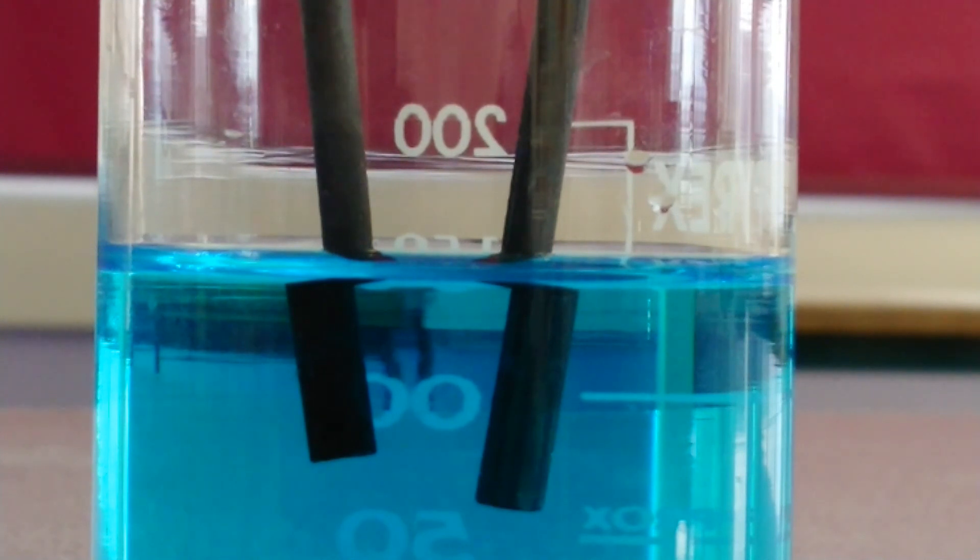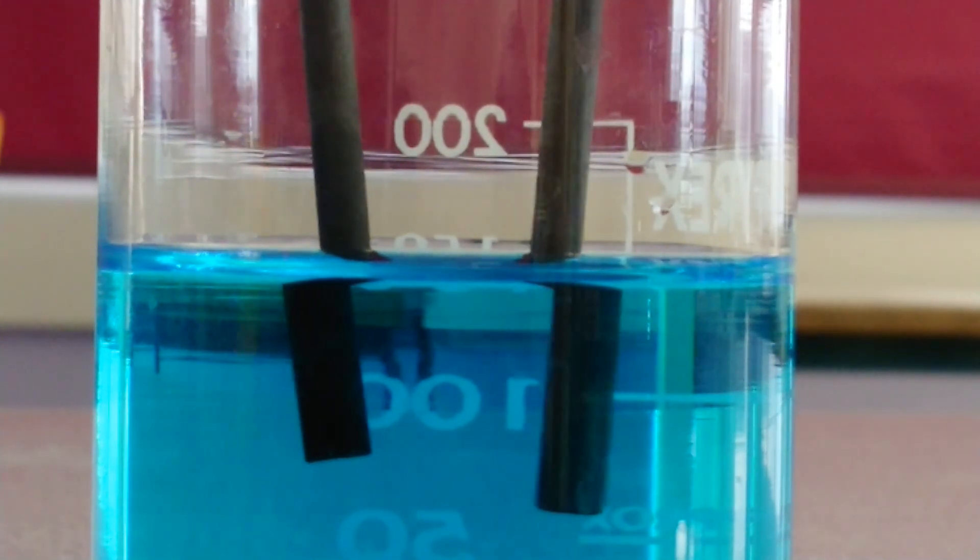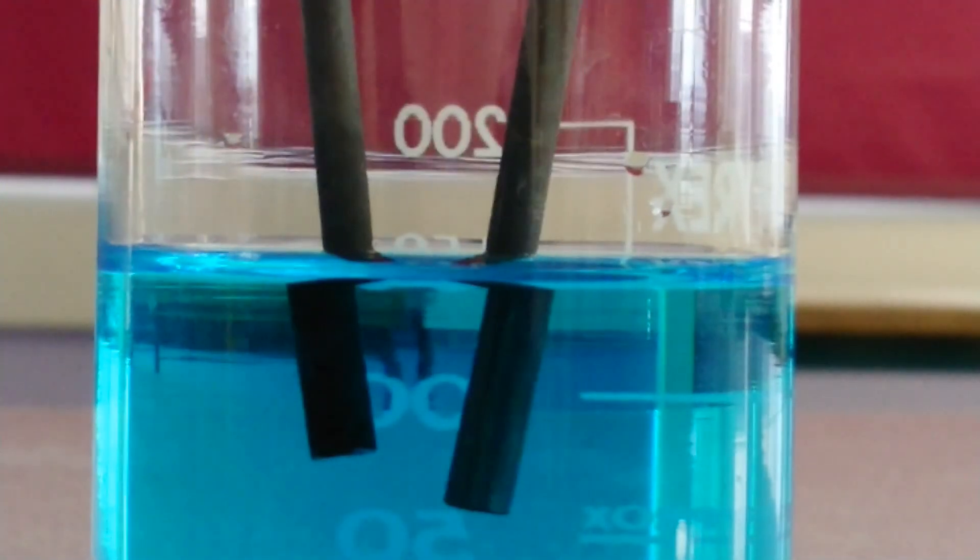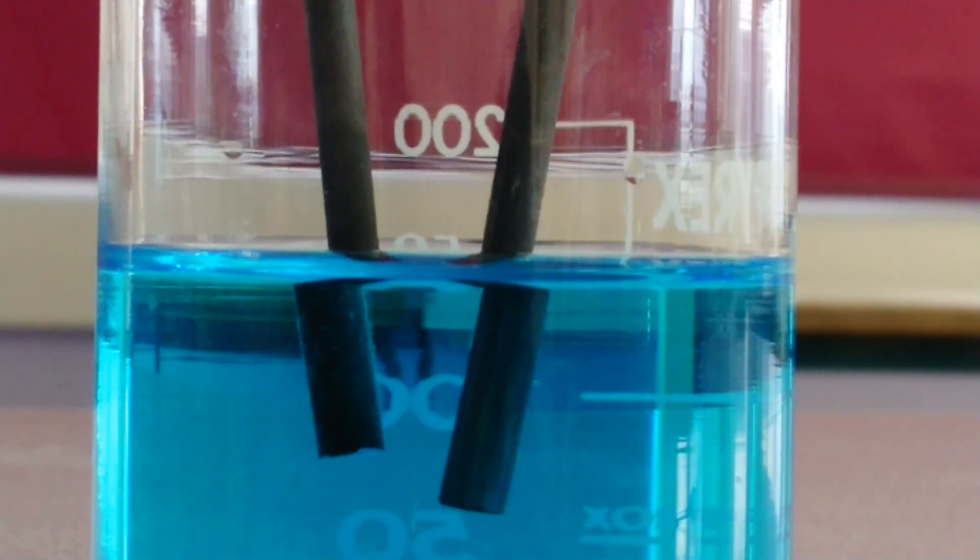We turn our power supply on. Our bulb is now on, and we watch carefully. Looking carefully again at the anode, we can see a gas is clearly being given off - loads of bubbles there. So let's test that gas. Let's hold the litmus paper in there and see what happens.